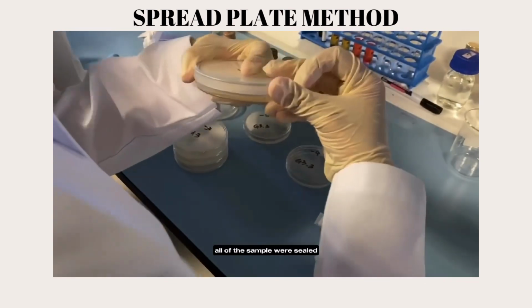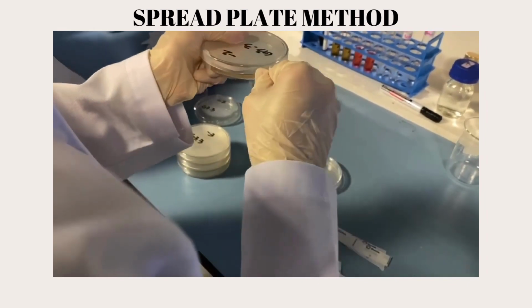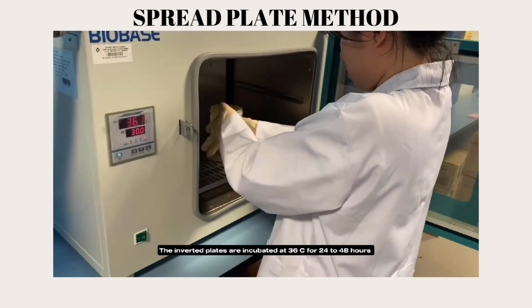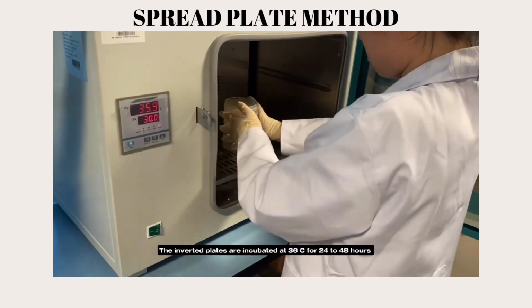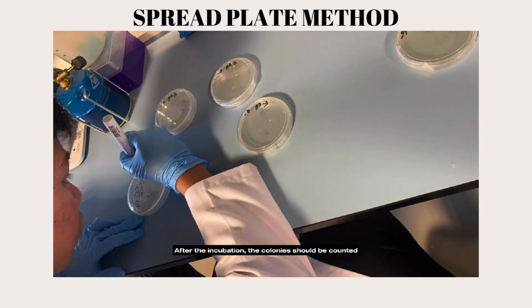All of the samples were sealed. The inverted plates are incubated at 36 degrees Celsius for 24 to 48 hours. After the incubation, the colonies should be counted.